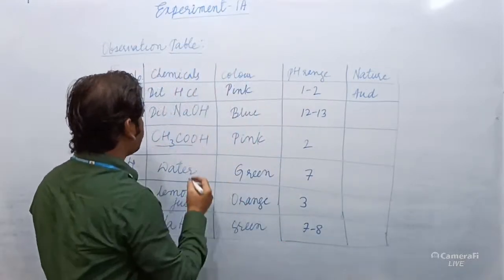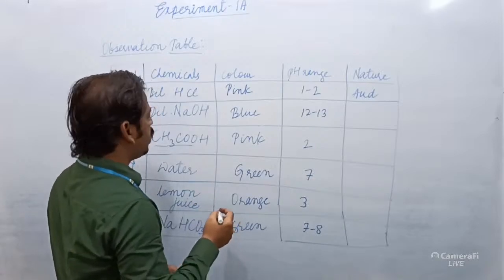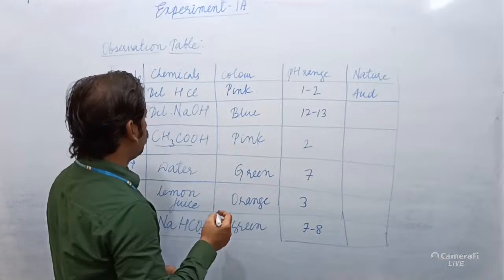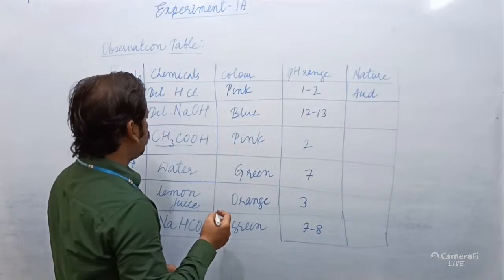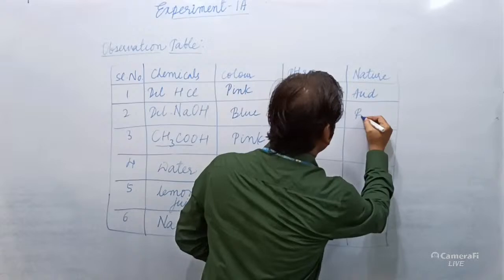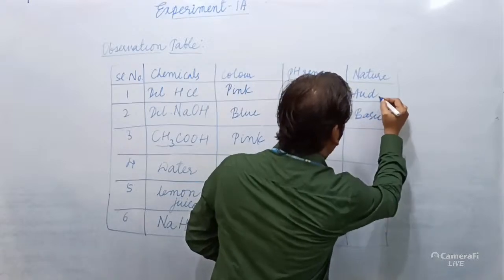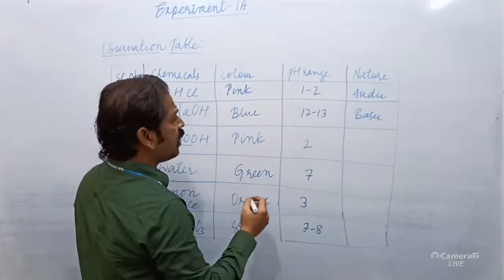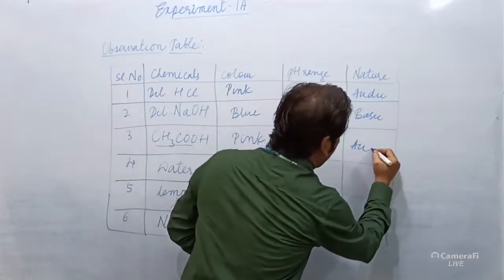Yes, second is dilute NaOH. It is blue color. Blue color is basic. Pink color is acidic.